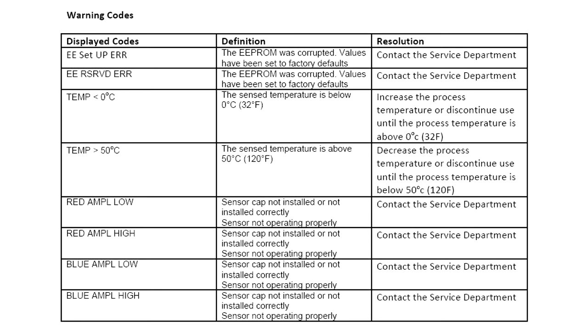Possible sensor warnings will be displayed by the SC controller. Clear the warning cause and confirm the displayed warning. A warning may be used to trigger a relay and users can set warning levels to define the severity of the warning. Warnings are defined in this table.